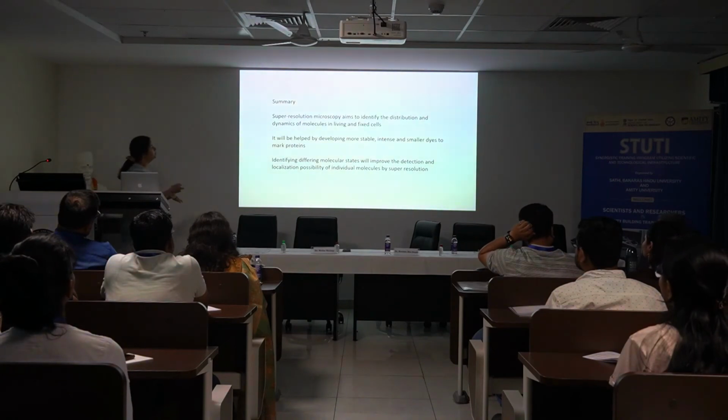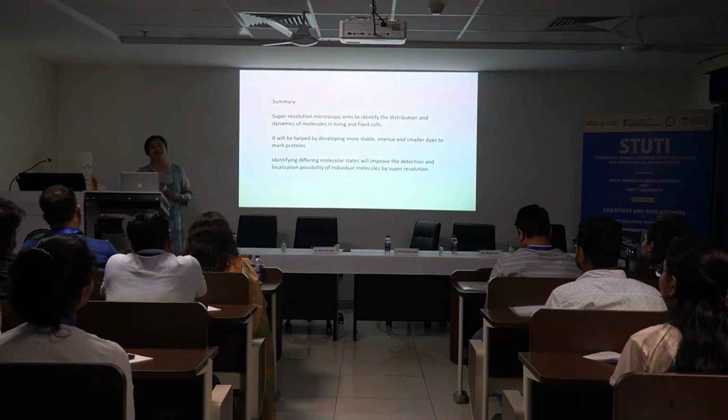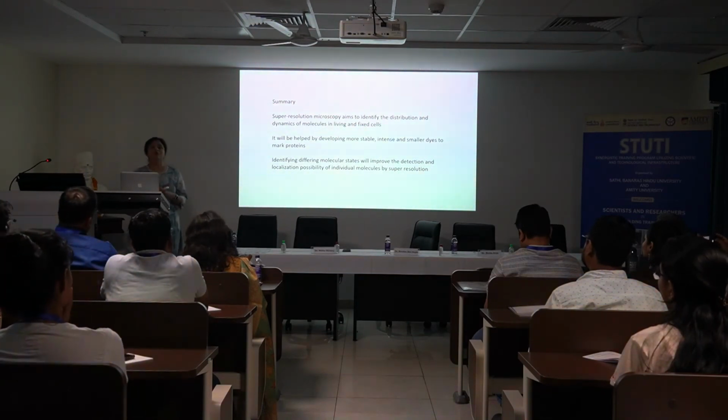Okay, so that just brings me to an ending summary of this talk, where what I've shown you, hopefully, is the importance of super resolution. Remember, we had electron microscopy already existing, but super resolution aims to identify the distribution and also dynamics, right?